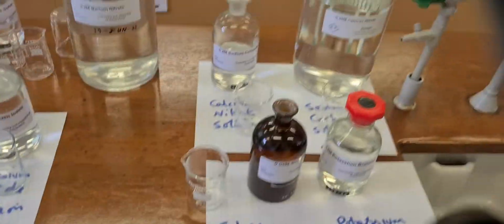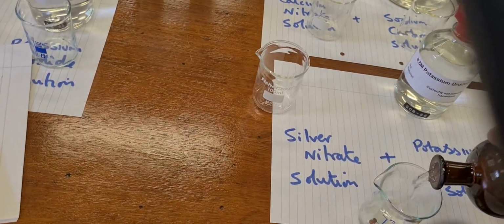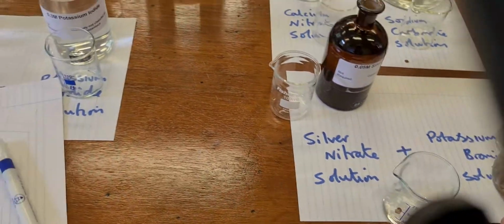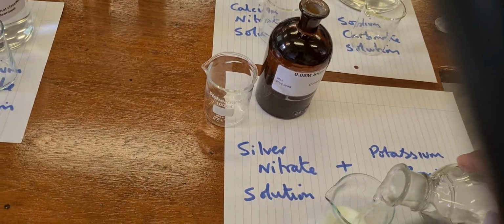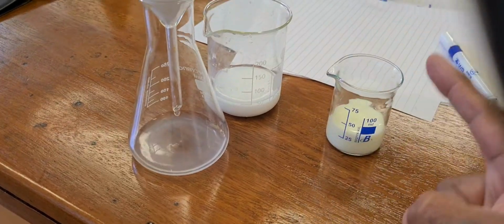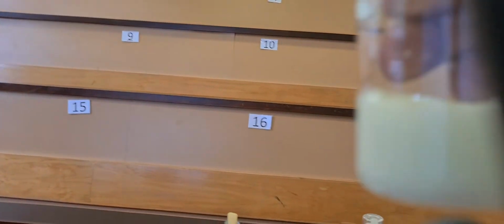So if I get this chemical, pour it, and mix it, potassium bromide, then the salt we're going to get will be silver bromide, which is a cream colour. Look, there, cream colour. That's a white colour. That's white. That's a barium sulfate. This is a silver bromide cream colour, and again, I could filter that.